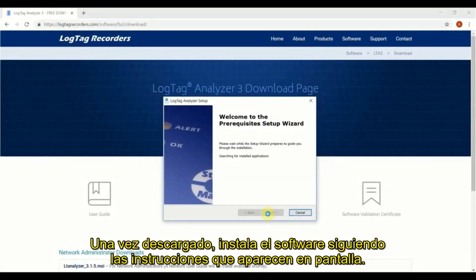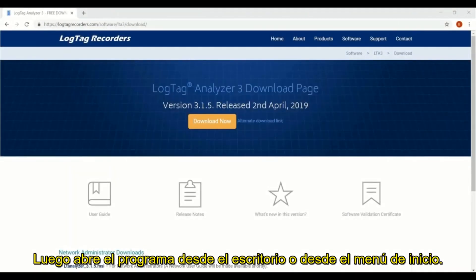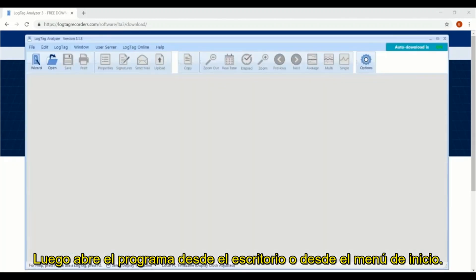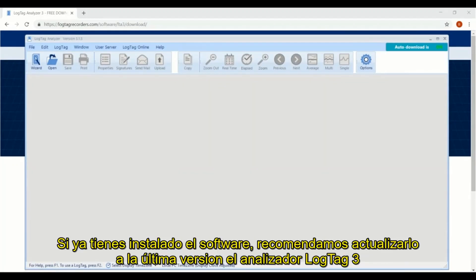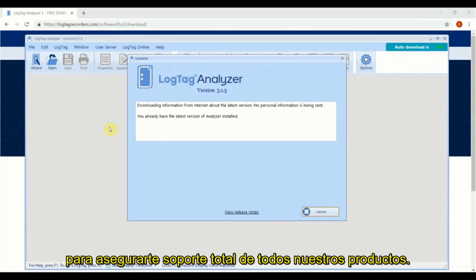Once downloaded, install the software by following the on-screen instructions, then open the software by clicking on the shortcut on your desktop or from the Start menu. If you already have the software installed, we strongly recommend updating now to the latest version of LogTag Analyzer 3 to ensure full support of our latest products.